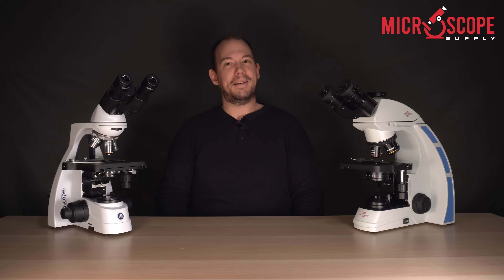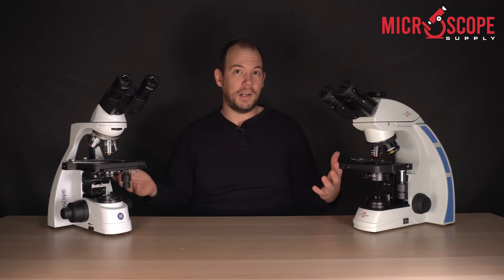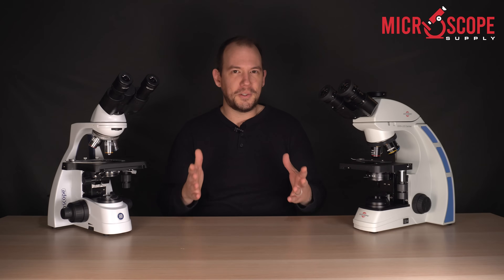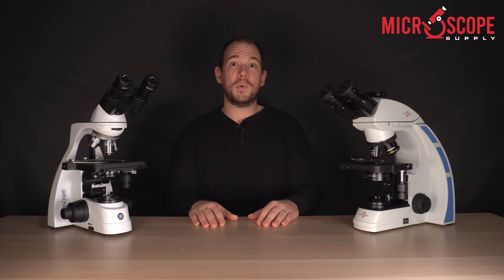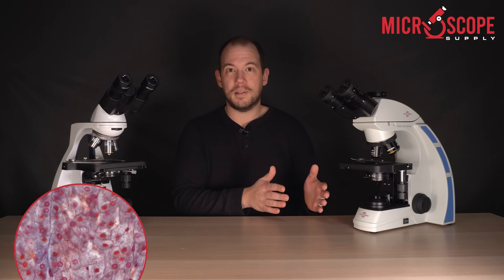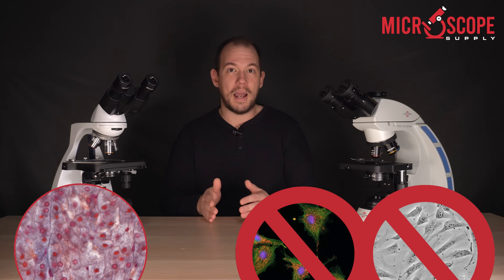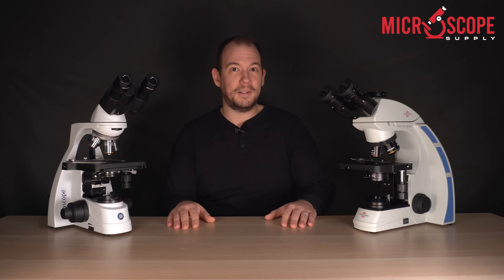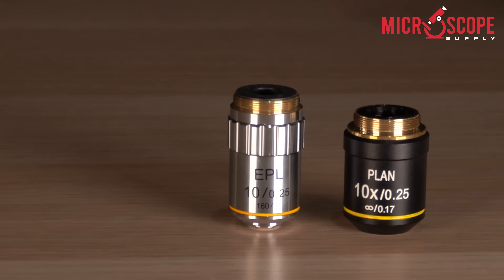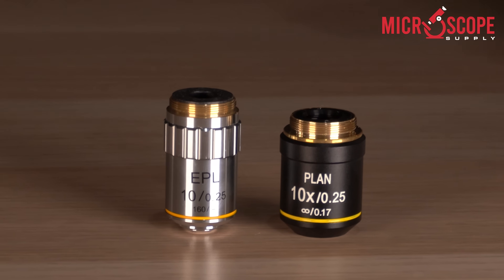Number one, and arguably the most important decision that you'll make when purchasing a compound microscope, would be the objectives. Before I get into objectives, we are going to talk about bright field objectives and exclude things such as fluorescence and phase contrast, or else this video would be fairly long. The two types of objectives that you'll probably come across are achromat objectives and plan achromat objectives.